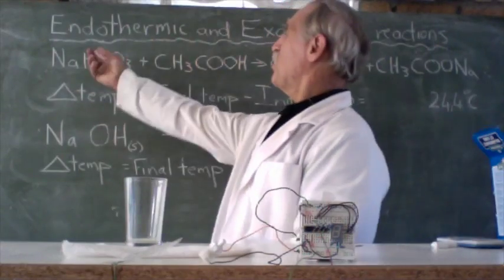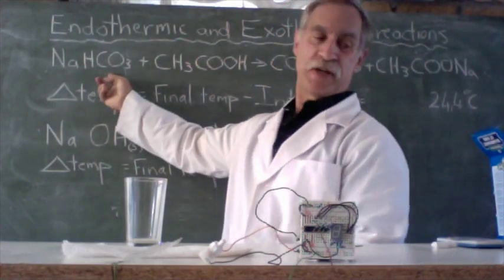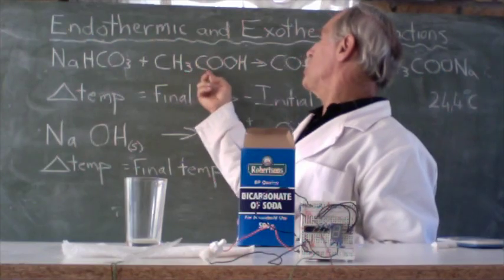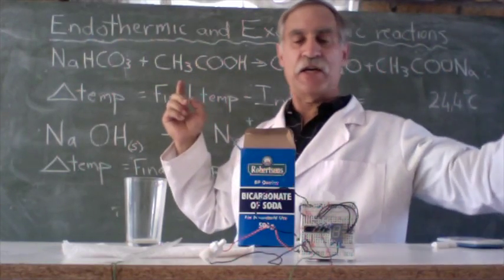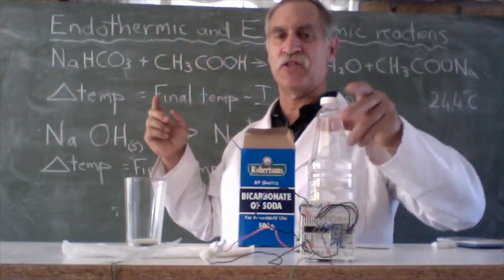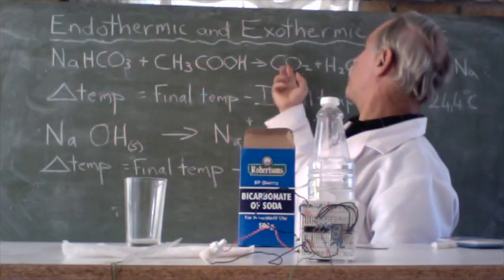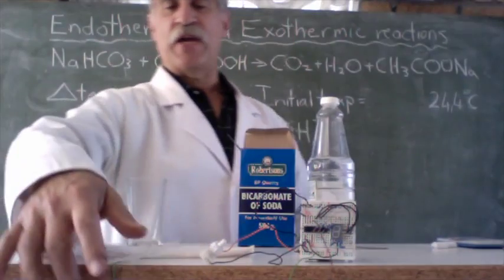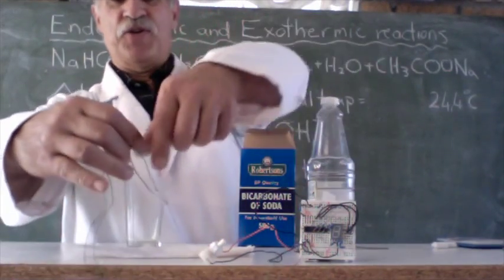Now let's take our old favorite sodium hydrogen carbonate, bicarb, plus CH3COOH vinegar. We're going to react the two together to form carbon dioxide, water, and sodium acetate. And we're going to measure the temperature while we do it.